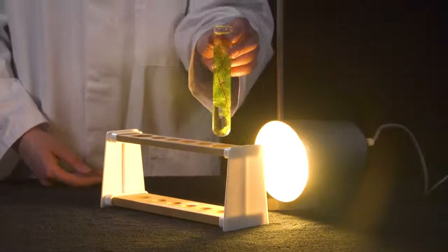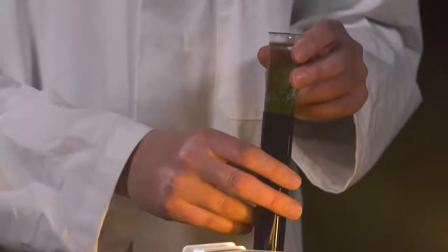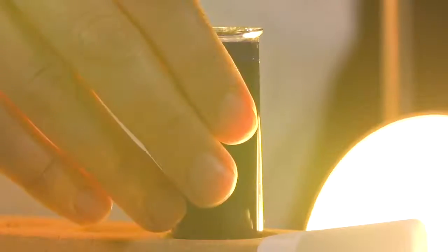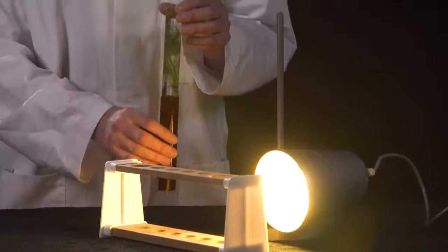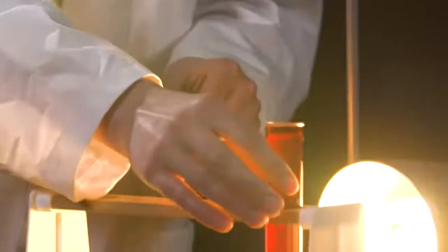Different coloured filter sleeves can be wrapped around the setup to allow students to investigate the effect of the wavelength of light on the rate of photosynthesis. From this, they can develop their own absorption spectra and further their understanding of which wavelengths of light are used most efficiently by the plant.